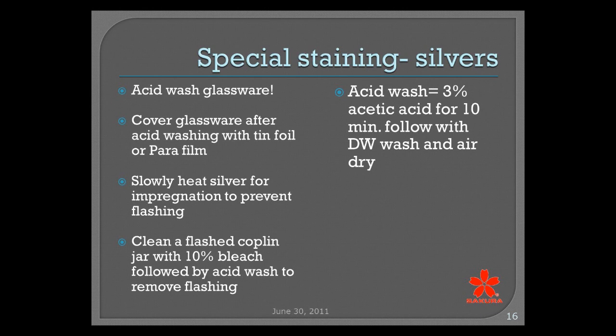And I found over the years that if you do flash your glassware, you can remove that flashing by soaking your glassware in a 10% bleach and then following it up with an acid wash.